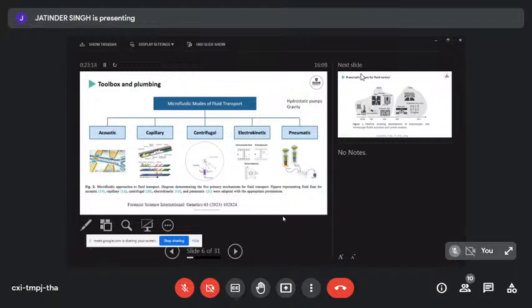In addition to that, we've got the hydrostatic pumps that we just went through in the slide that Suleiman made. And we've got simple, humble gravity as well. If we just make sure our liquid level at the inlet is higher than at the outlet, we will get a flow. I've said before that that could be undesirable. It's actually quite an effective way of pumping as well.